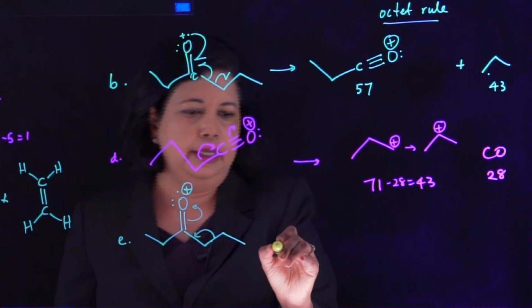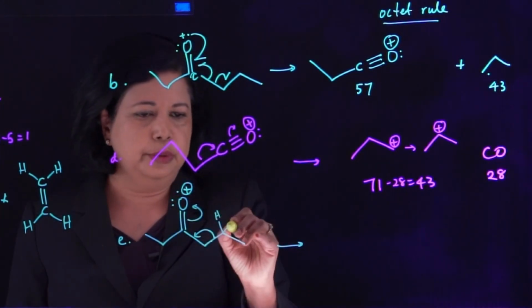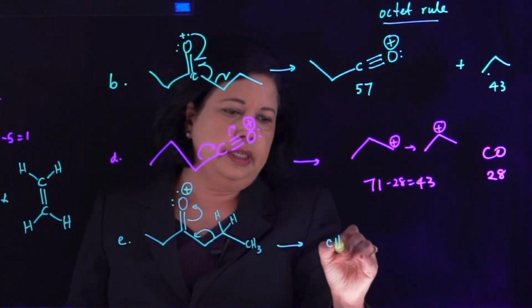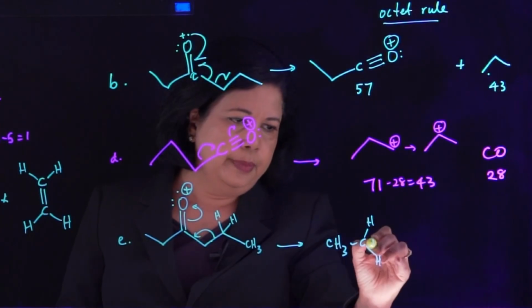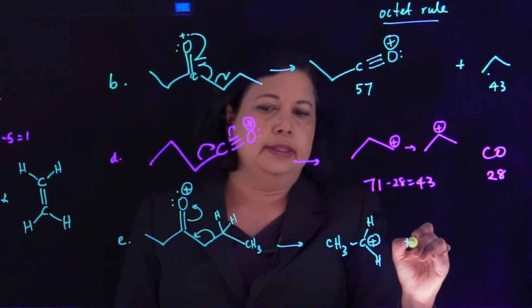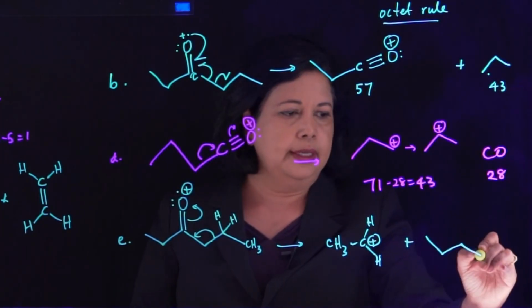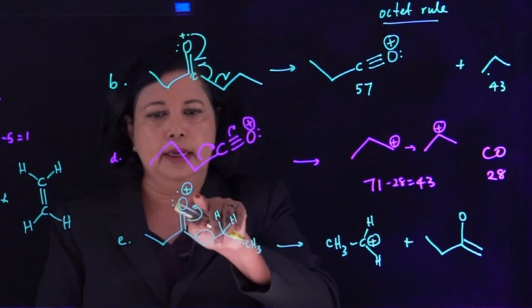All right. So here you go. So once you take off these electrons, there are 2 hydrogens here and a CH3, and that is going to give you the cation peak. Positive. 1, 2, 3. 4 minus 3 is a plus 1. And you could think of this as having a fragment here. Now you have a double bond there, and your oxygen is going to get another lone pair.